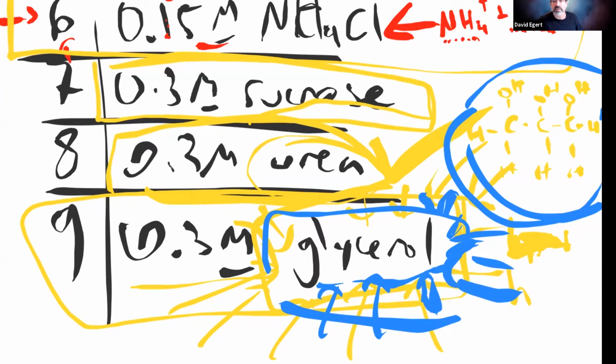So what is that going to mean in terms of what you see when you put your cells into glycerol, spin them down, and check how the cells look, or whether they lysed? Maybe a hybrid? Could be a hybrid. And what else is going to make a difference? Maybe it'll take a long time. Yeah, exactly. It depends how long you let the cells sit in there before you spin them down.